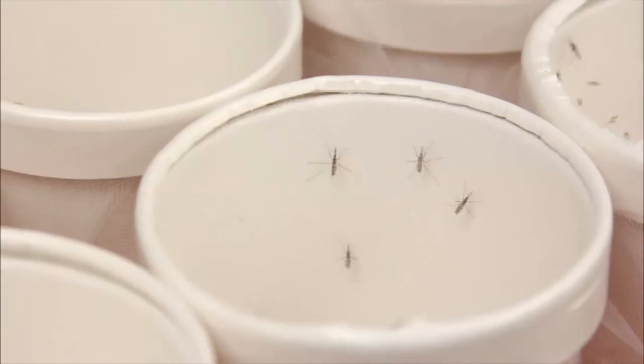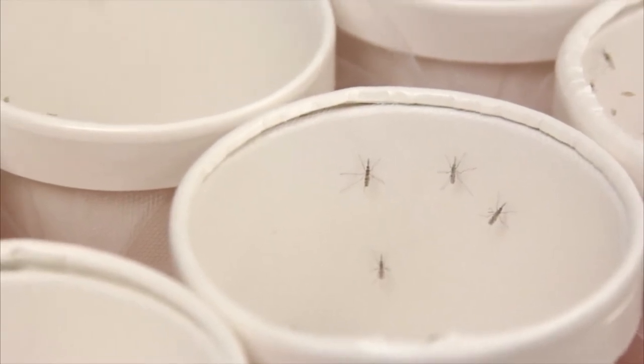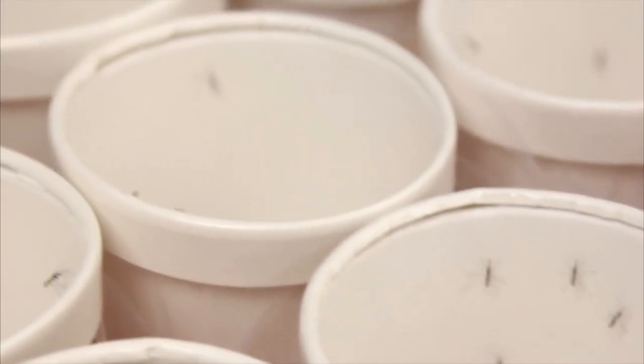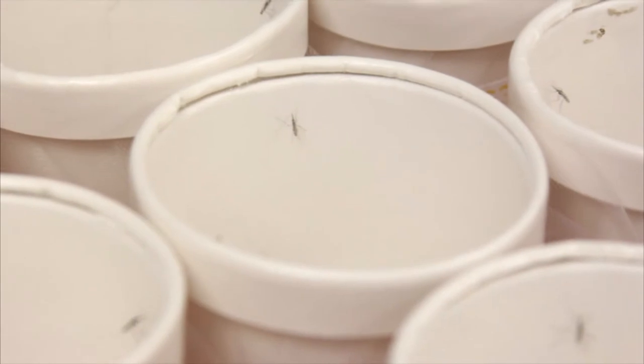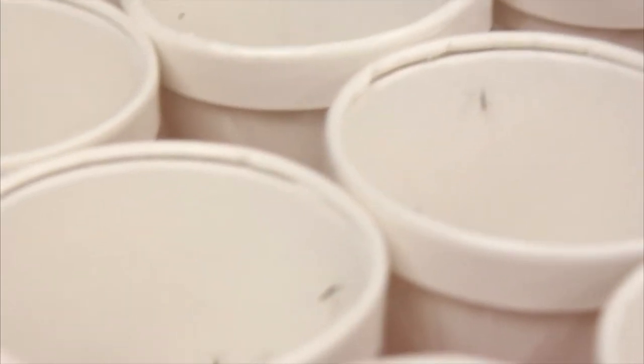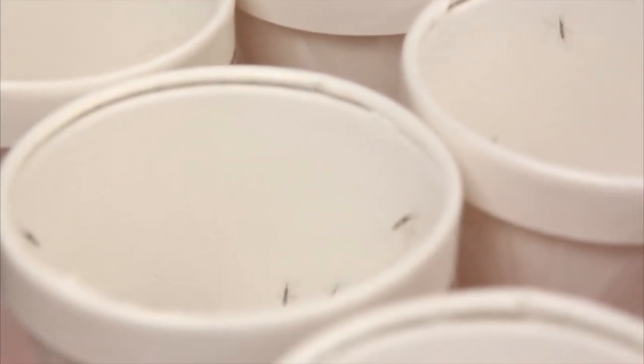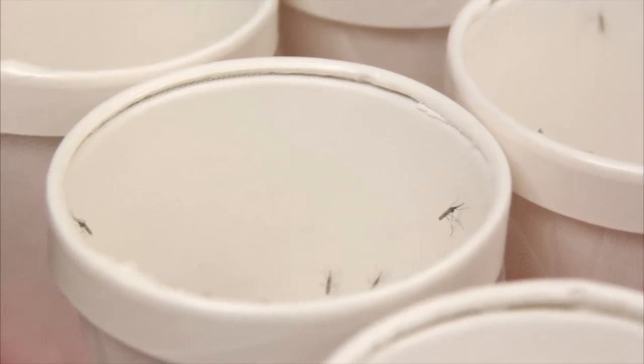Some transgenic colonies can only be maintained by continually outcrossing them with wild type mosquitoes. For outcrossing, use virgin females that are around five days old. Before adding the females to the colony cage, check the cups to make sure that all the mosquitoes are females and remove any cups contaminated with males.